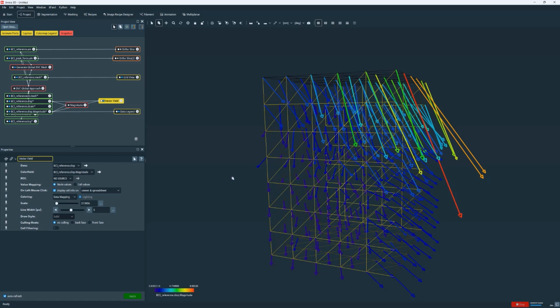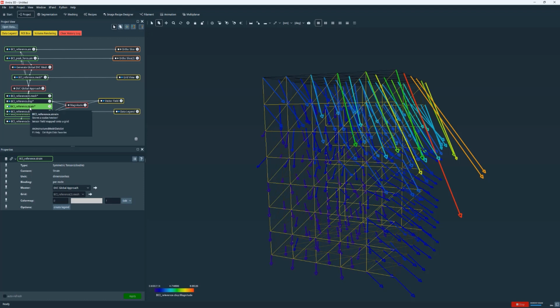And then now we can also export components that belong to the mechanical strain, and we can also convert the components into a volume. So that's why I'm going to open another Amira project, and then I can show you more details about the mechanical strain and how you can generate the surface.